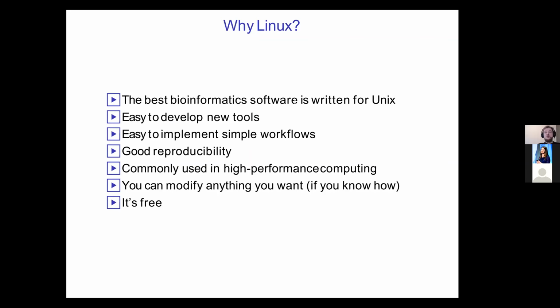Easy to implement simple workflows because we can write bash scripts, which I will tell you about later. And you can combine those bash scripts, and there are other specific programs which allow you to create simple but very effective and fast workflows.